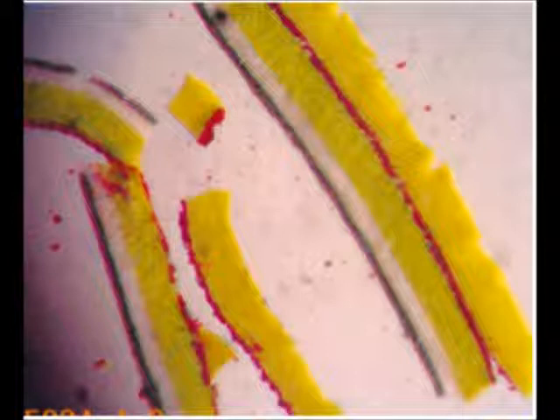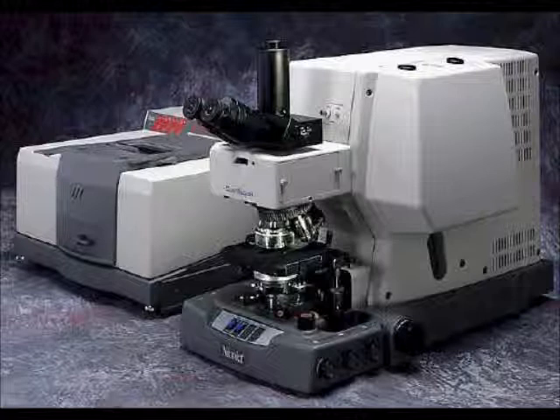The ideal sample is approximately 5 to 15 micrometers thick. Thick samples can be examined by cutting and flattening them prior to observation with the micro FTIR. The sample is then viewed under the FTIR microspectrometer. Absorption bands are noted in each layer, and layer colors are recorded. All this information can be used to compare a potential paint source. The paint source would then be observed and compared to the paint sample.